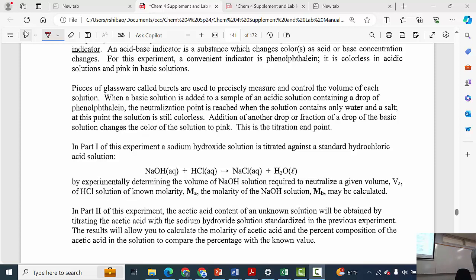And so normally what I do is this. Even though this is full, I can tilt this almost horizontal like this. And it's much easier to push the air bubbles out horizontally than vertically. This is like if you put a ball in a swimming pool and try to push it down.